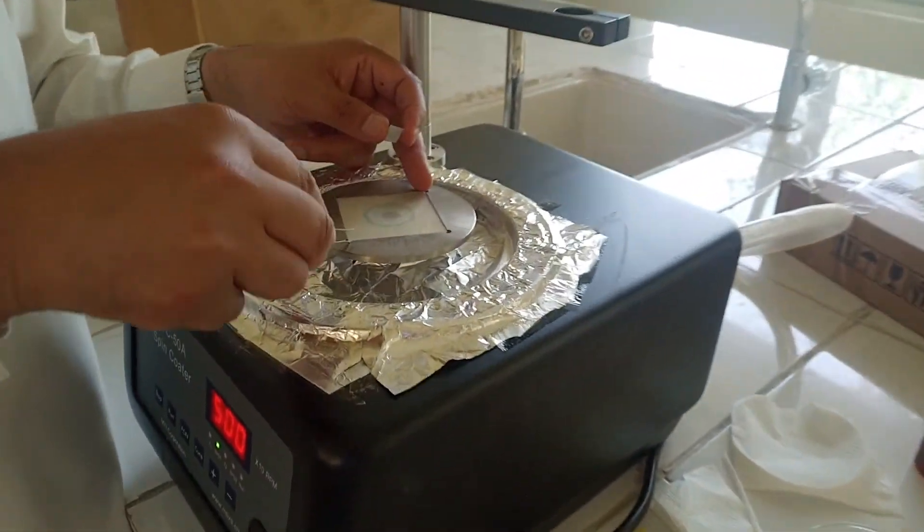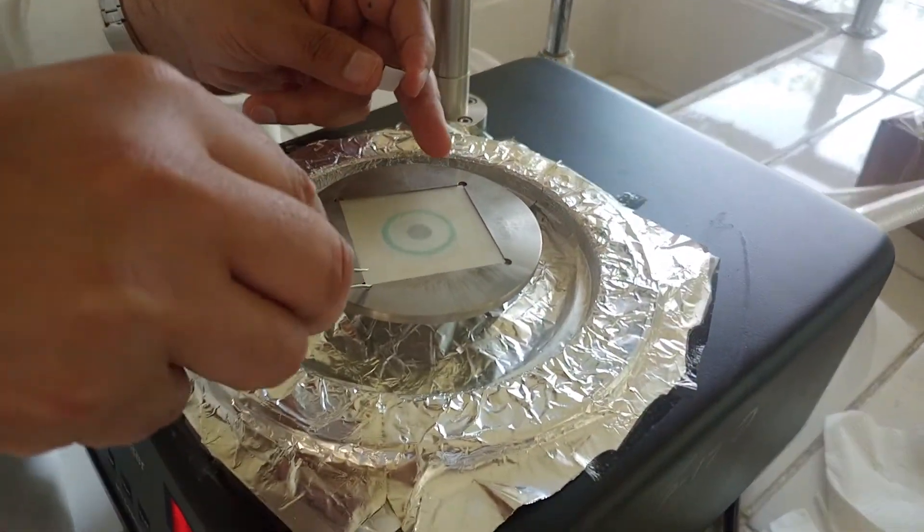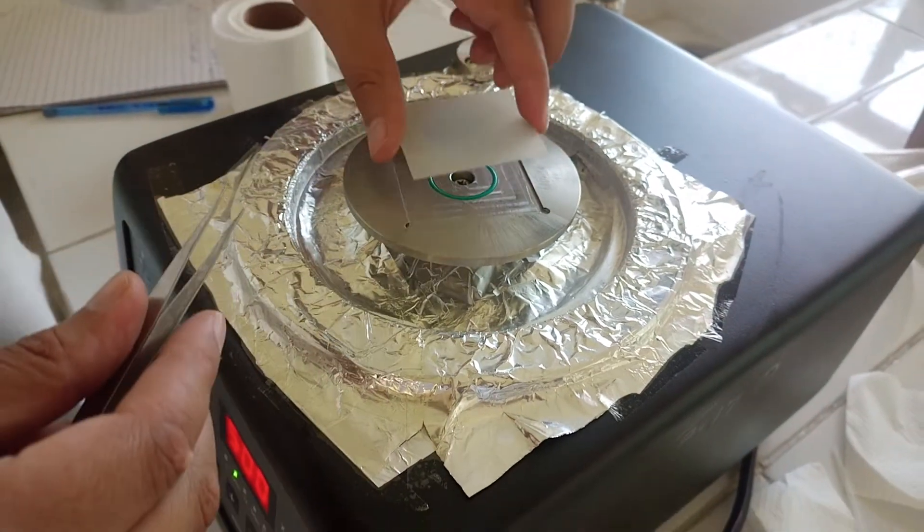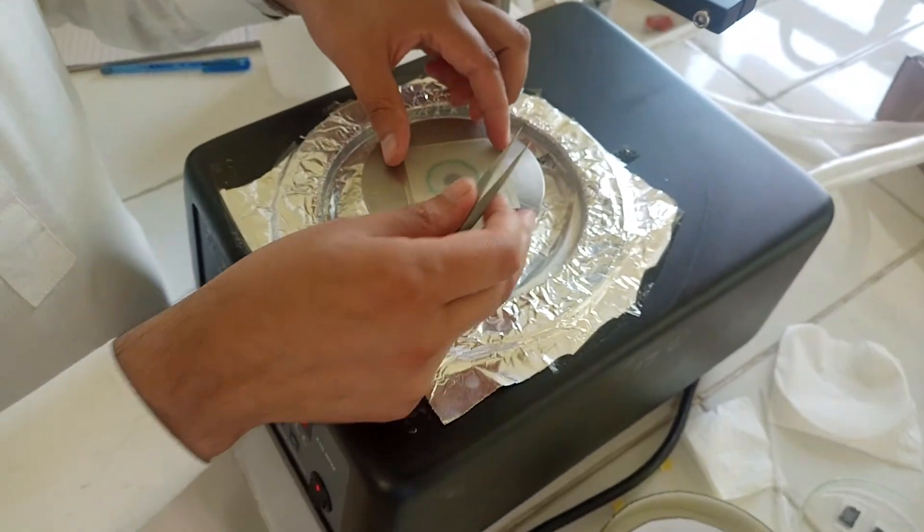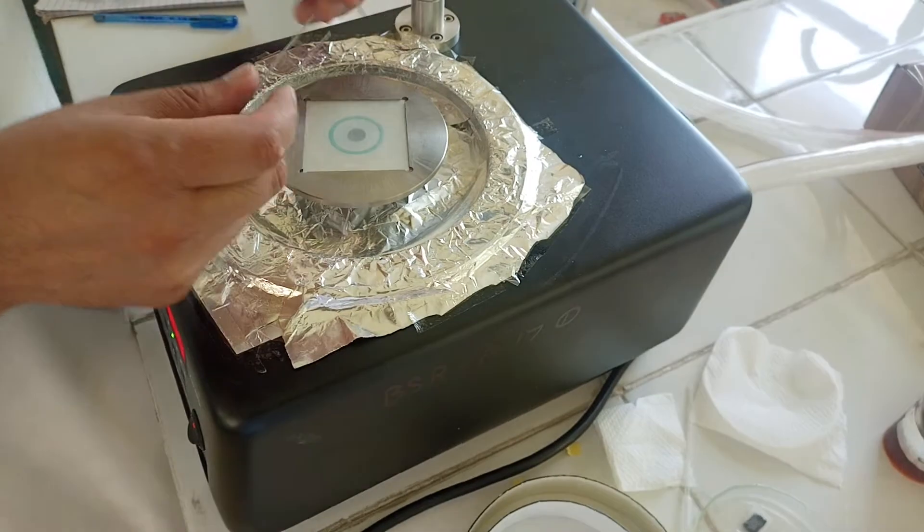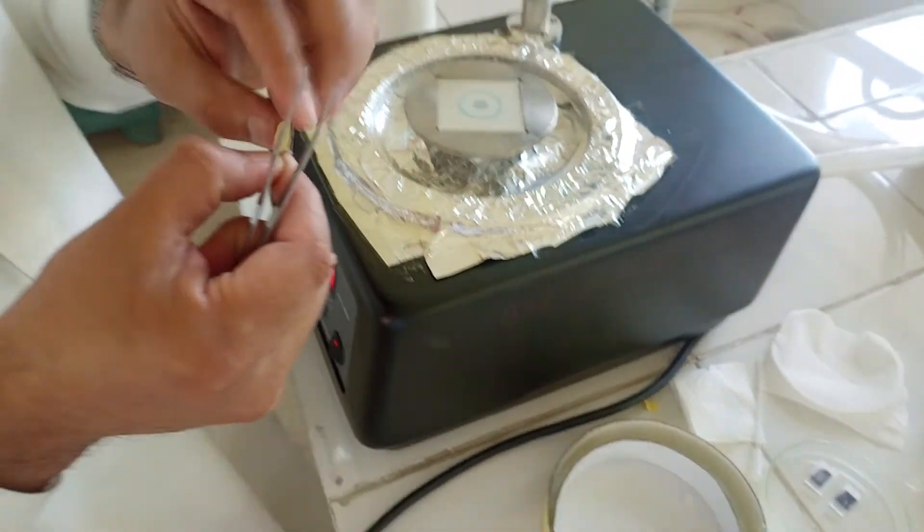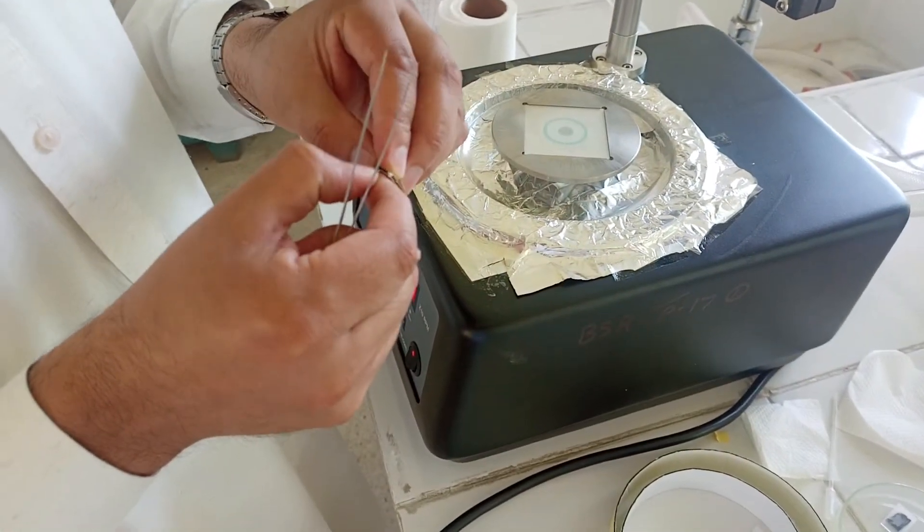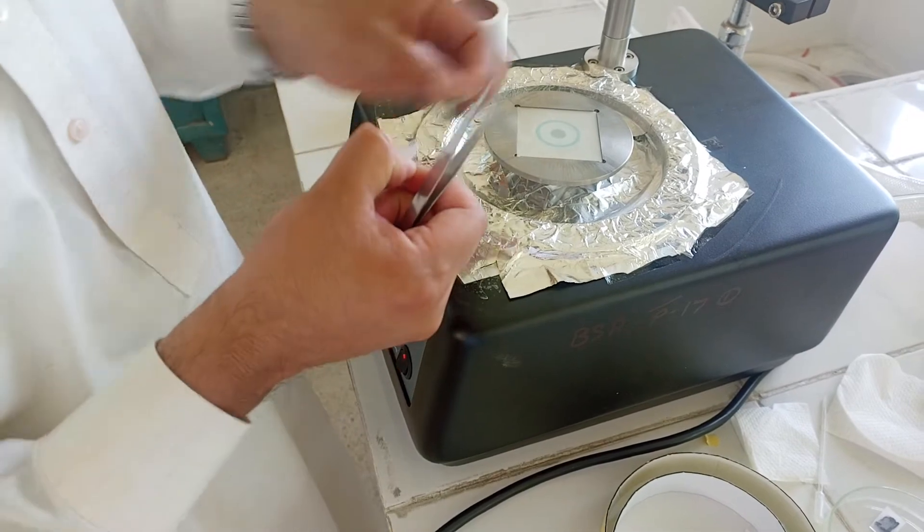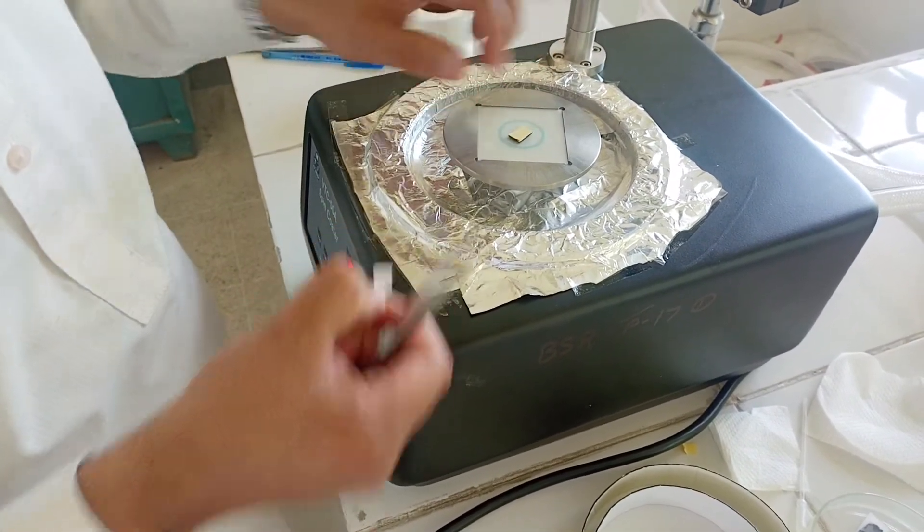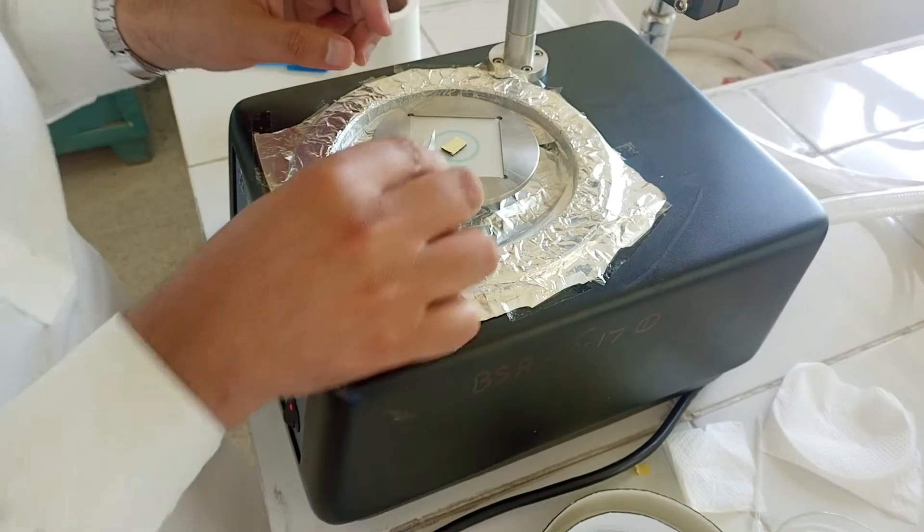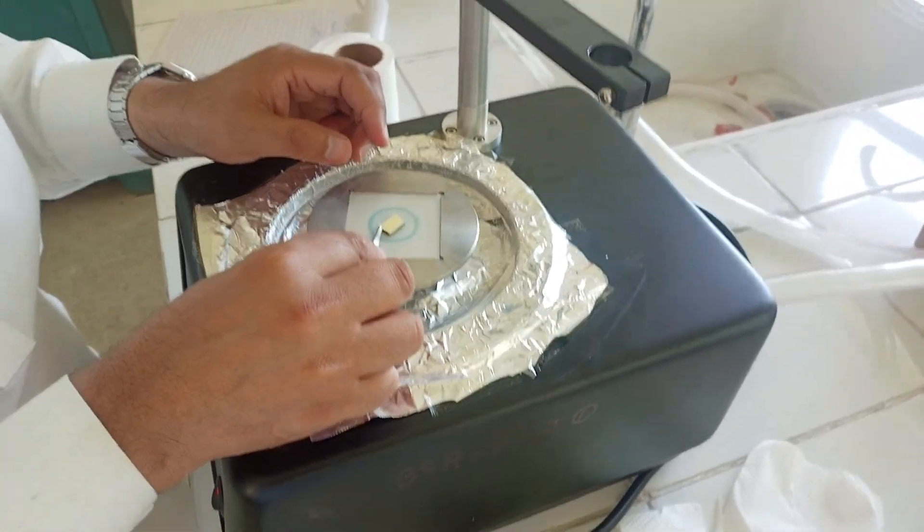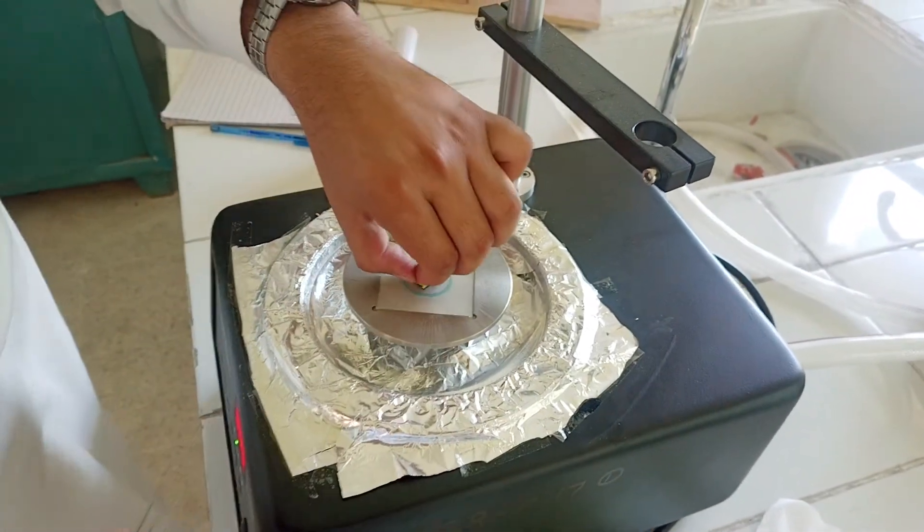Now we will take the chuck that we have placed here on the top, so we will place it here. Then we will use double tape and we will fix it here. Then we will remove the paper layer of this double tape.